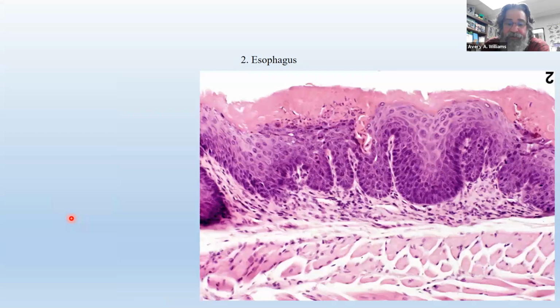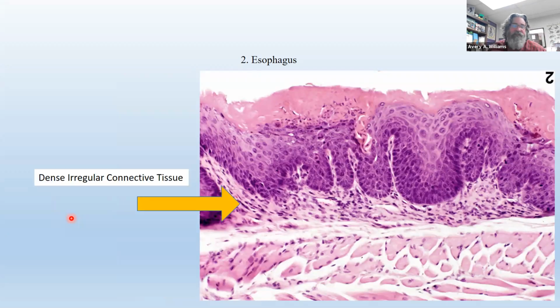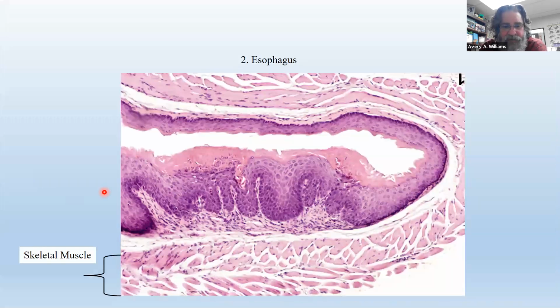So the submucosa is made out of basically the same thing that your reticular layer is made out of, dense irregular connective tissue, okay? Some books might argue that this, particularly up here in these little papillae, is areolar. That's fine. Remember I said the only difference between areolar and dense irregular is the amount of collagen fibers. And so I always like to say that submucosa in general is made out of dense irregular. That's what I call it. And if I ask you to name this tissue, you call it dense irregular. Or just memorize: submucosa, dense irregular, like that.